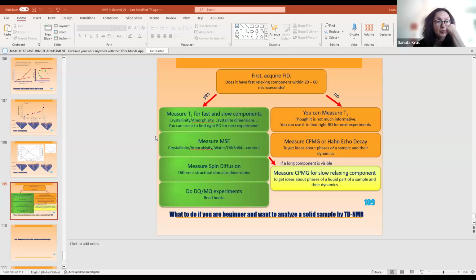It's single exponential in our case, despite a lot of effort. I tried to encourage Adriana to check the predictions theoretically, but I think we still have to work on that. However, focusing on experiment, the spin-lattice relaxation is single exponential, the spin-spin relaxation is bi-exponential.